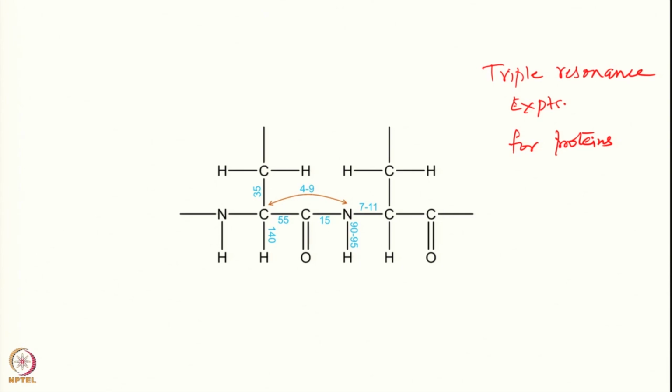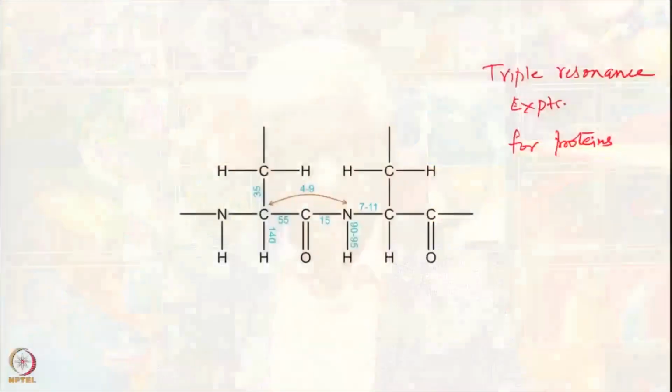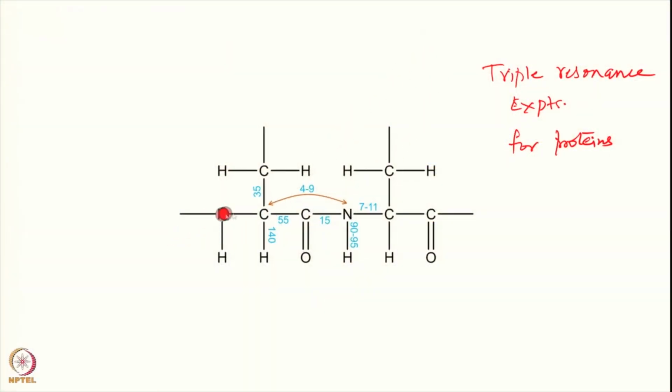The application of NMR in structural biology has primarily been driven by application in proteins. Also of course nucleic acids and other systems, but by and large methods development has occurred because of applications to proteins. So here I show this slide again to you indicating the strategy. We have here a dipeptide NH C alpha CO, NH C alpha CO, and the transfer of magnetization happens through this polypeptide chain, either through the backbone alone or through the side chains as well.